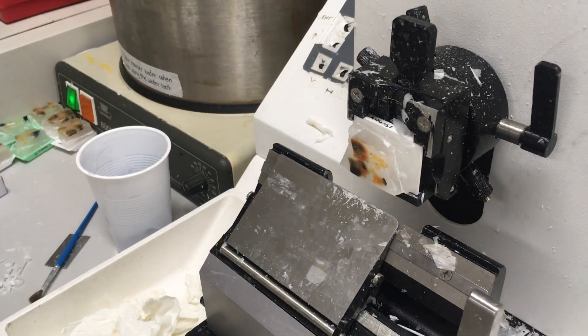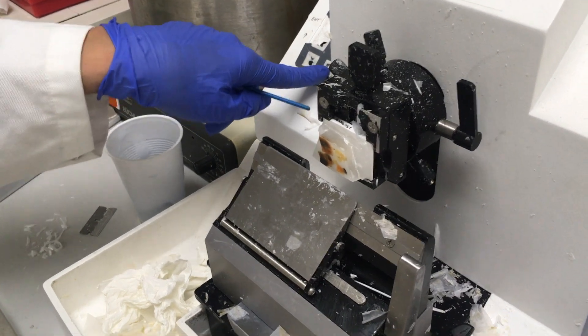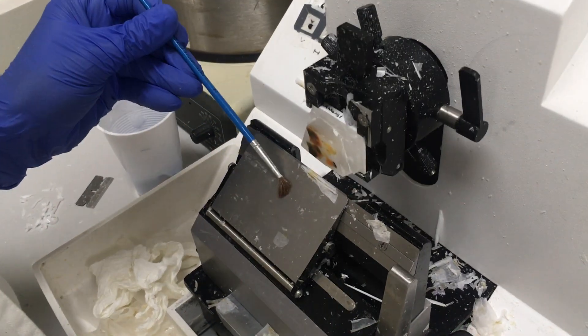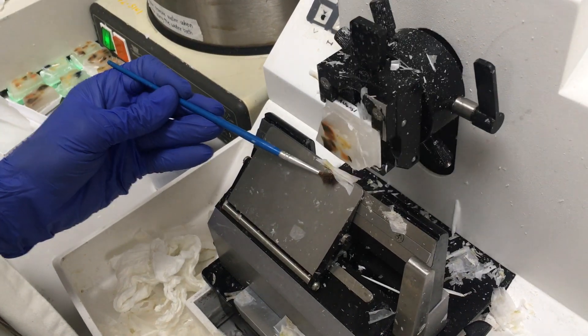I remove the excess and I'm trimming. I'm taking seven micron sections and trying to get one that is not torn in any way.